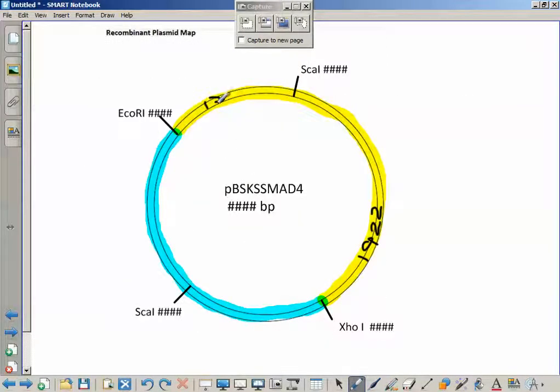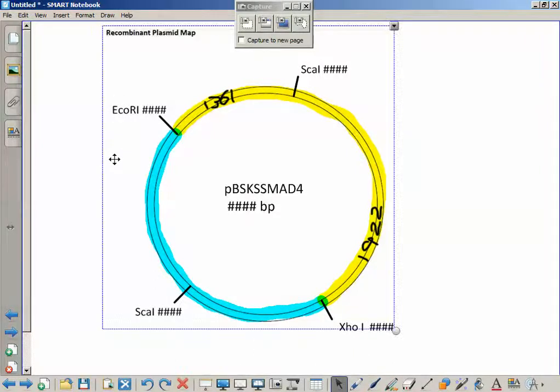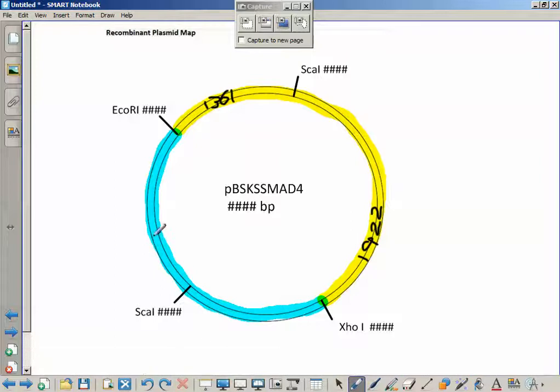The reason you write these fragment lengths between the cut sites is to give you a clearer ability to add and subtract when you do your digestions. Because there's a diagnostic digestion you have to do at the very end to prove that this gene actually did incorporate and connect up with that gene. Hey, that's kind of cool. The colors overlap, so that's like their sticky ends overlapping. Then of course you need to put your numbers in here.